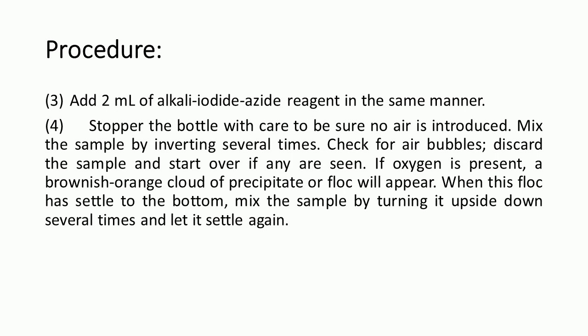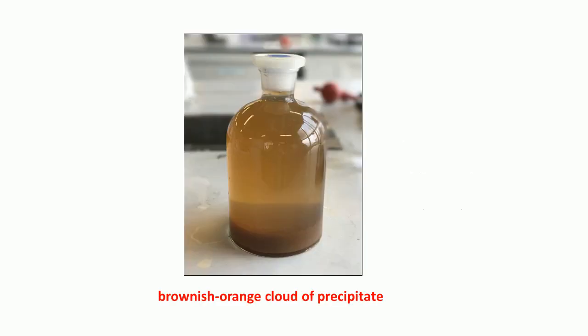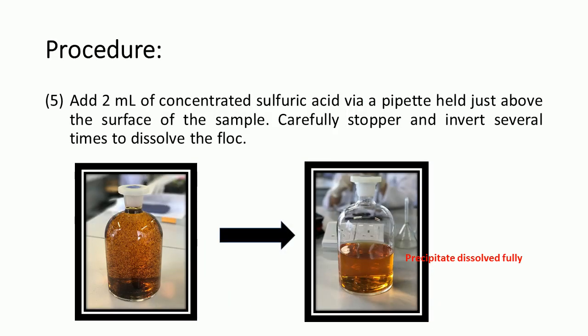Then, stopper the bottle with care, making sure no air is introduced. Mix the sample by inverting it around 5 times and check for air bubbles. If oxygen is present, a brownish-orange cloud of precipitate or floc will appear. When the floc has settled to the bottom, mix the sample by turning it upside down several times and let it settle again. As seen in the picture, the brownish-orange precipitate has settled. Then add 2 ml of concentrated sulfuric acid with a pipette held just above the surface of the sample. Carefully stopper and invert around 5 times to dissolve the precipitate until the solution becomes clear.